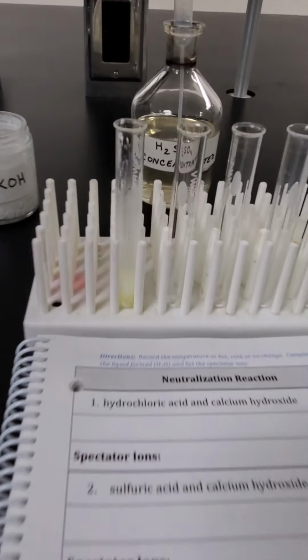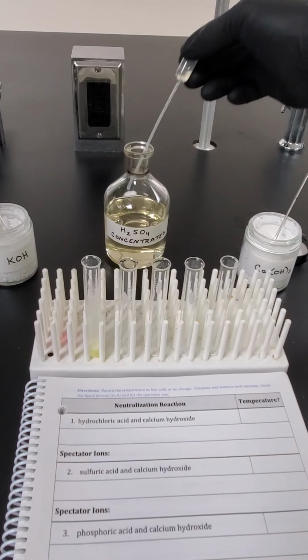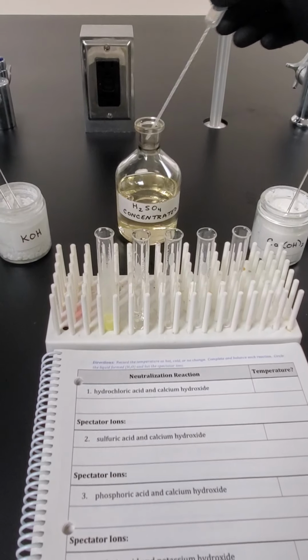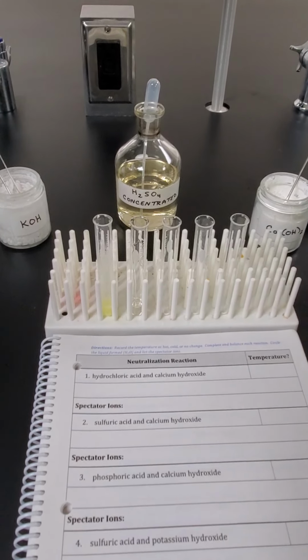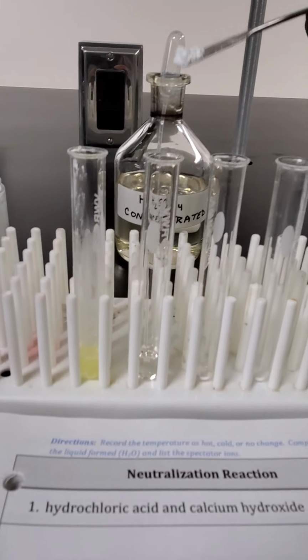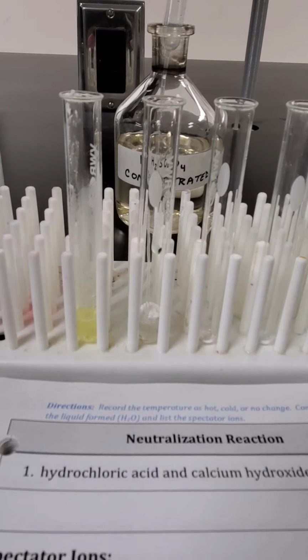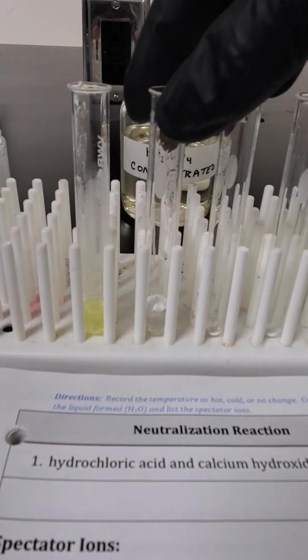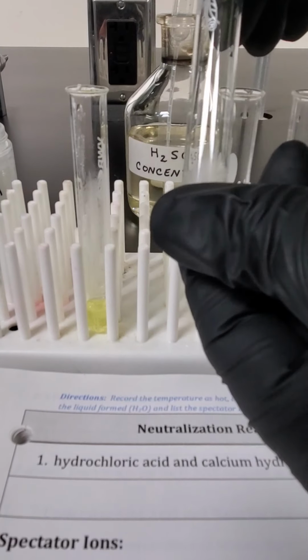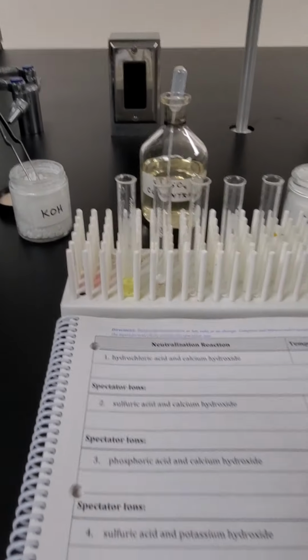Next we have sulfuric acid. Very syrupy. And calcium hydroxide again. So here comes the base. Not near as aggressive, but if you feel it, it is getting pretty warm. Next one is phosphoric acid.